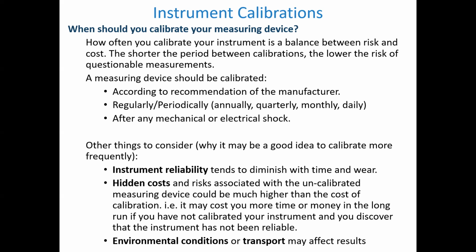And the hidden costs, right? If you want to make sure that your value is accurate, you want to be saving your employer time and money, right? If there's some question as to whether the instrument was calibrated, then that sometimes can become a really big deal. So there's some things to think about. Like I said, there's often a variety of reasons why you might calibrate, from technical reasons around precision and accuracy, to other things, like legal or manufacturer recommendations as well.